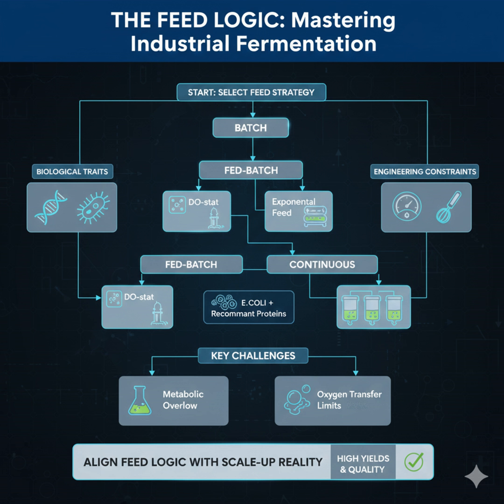Right. Your oxygen transfer capacity is just the maximum OUR that your kLa will allow. If the cell demand exceeds this, you starve the culture. It's that simple. And the second law of thermodynamics tells us that all that metabolic activity generates heat. So your maximum cooling capacity dictates the volumetric heat release you can tolerate before the batch just overheats.